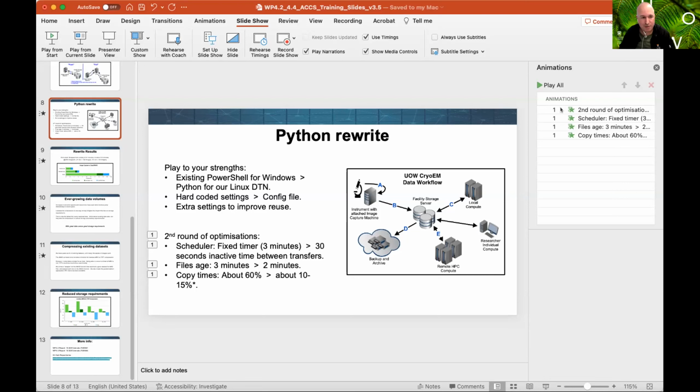Yeah, and the new K3 detector, they come off as TIFFs to start with. We don't get them as MRCs anymore. So that was kind of why we went back and had a look at all this old existing data. If we can slash the amount of storage space we need for backups and just on the facility storage, or at least we can now fit more stuff in the same space, so to speak, then that's great as well. Cool, I might look into that as well. Thanks.